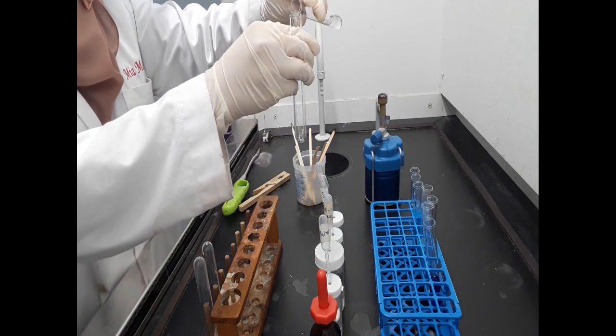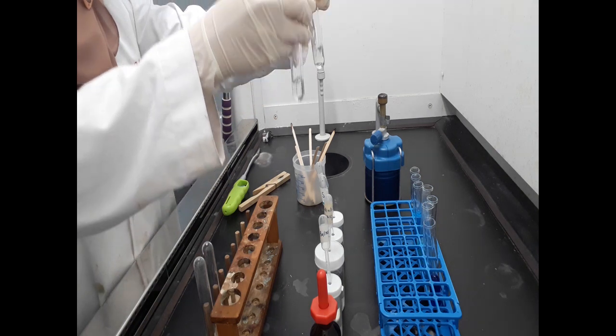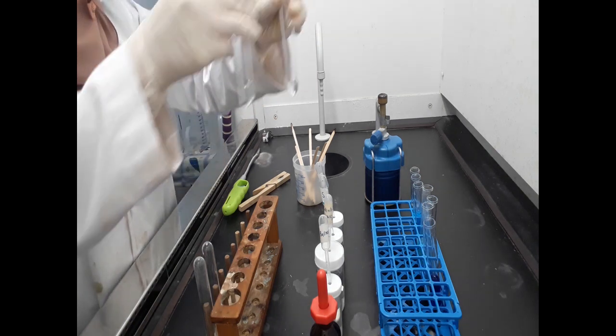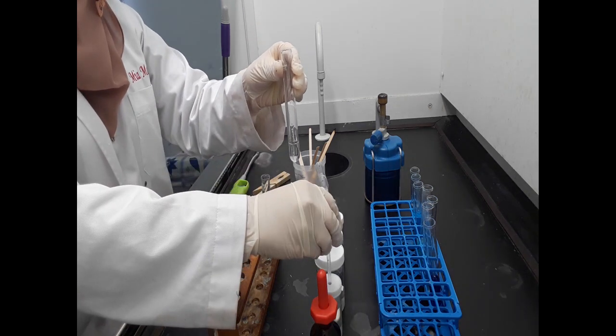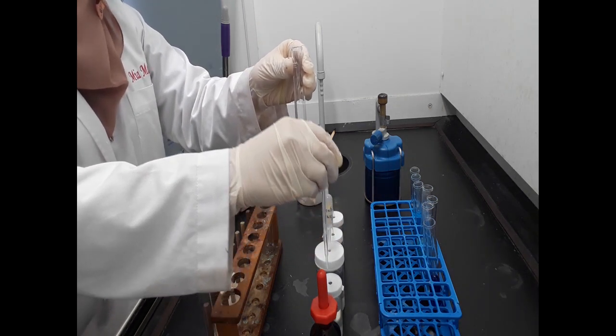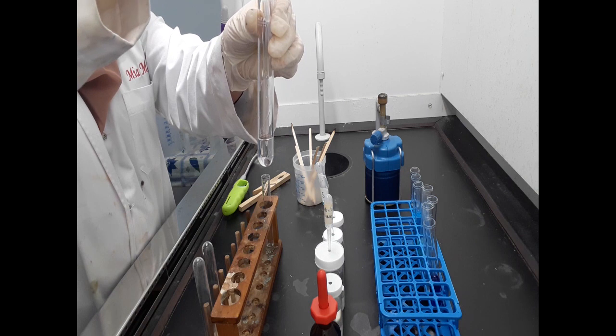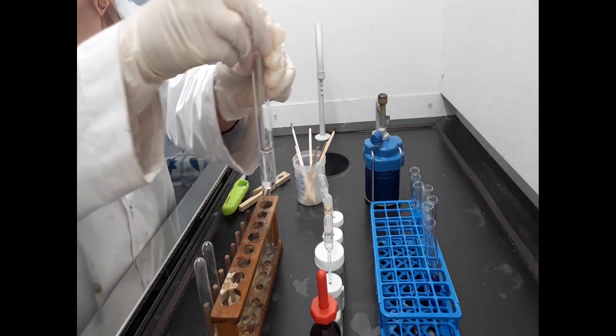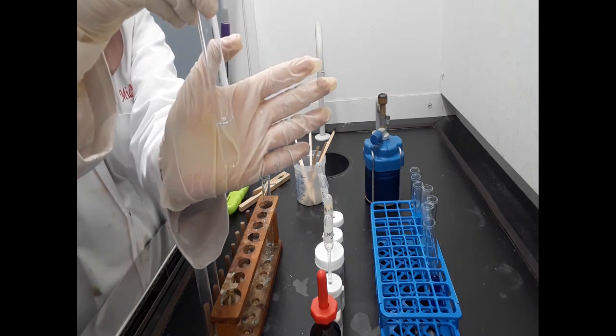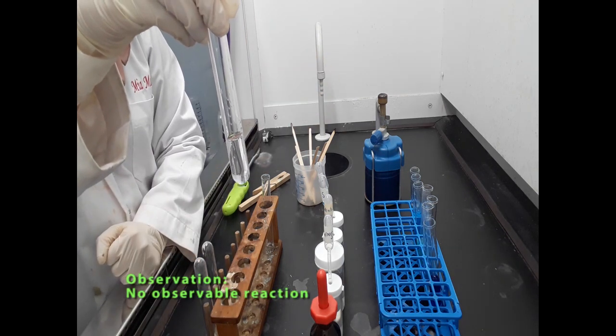And then pour half of the mixture from A into a test tube and add an equal volume of aqueous barium nitrate. Still no reaction.